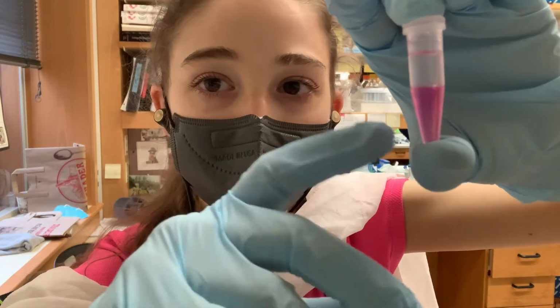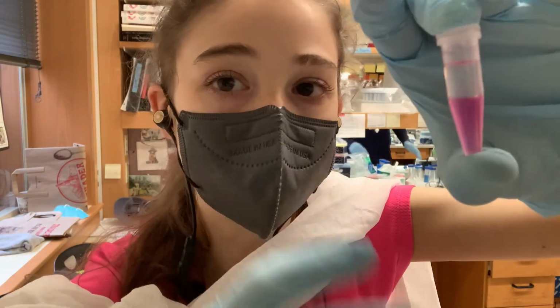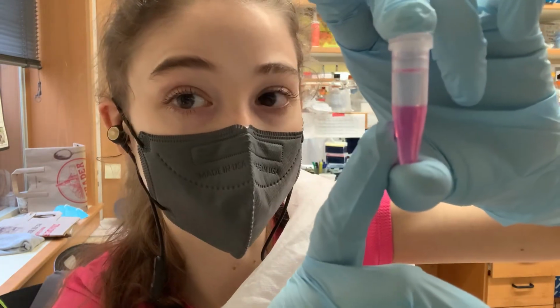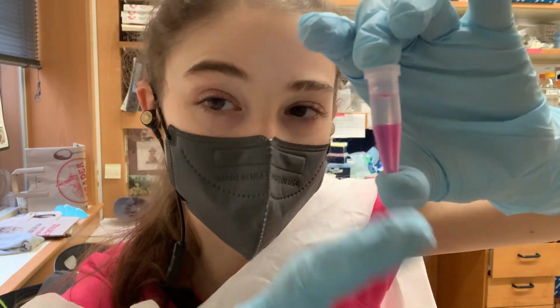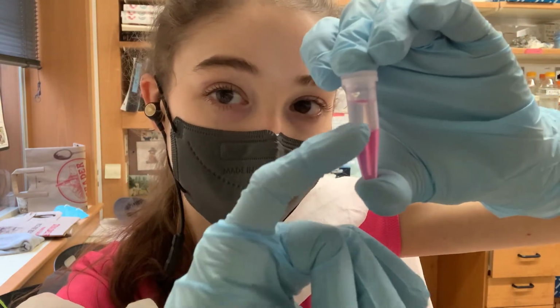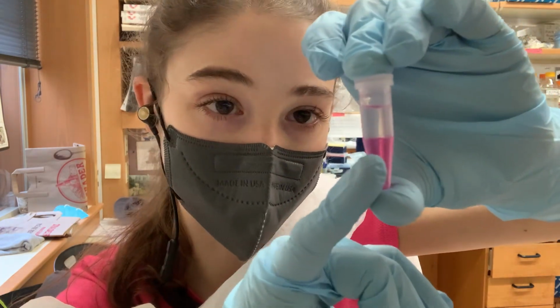The basic idea is that we go through different steps and we give the molecules a choice: do you want to hang out in the aqueous phase or the organic phase? Then we can selectively get the different molecules by altering the conditions and adding different chemicals, so that just the RNA wants to hang out in here and everything else wants to hang out down here.